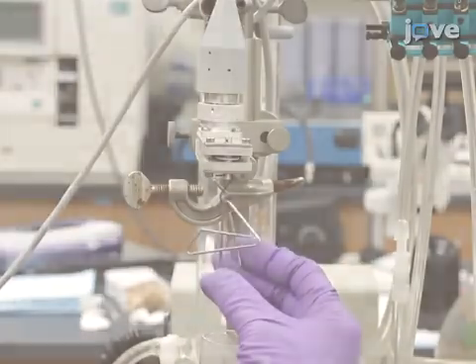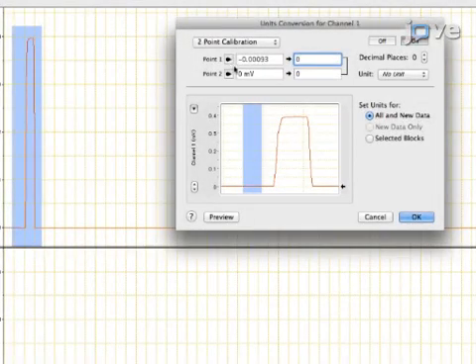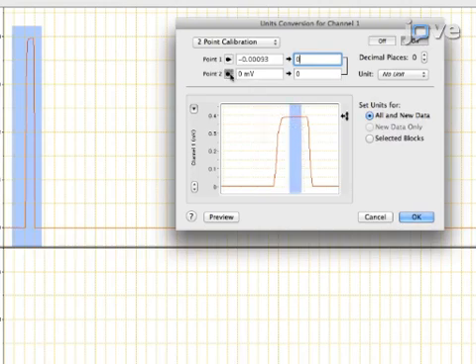The force transducer should be calibrated and must also be powered up at least 15 minutes prior to the experiment to bring their temperature to equilibrium.